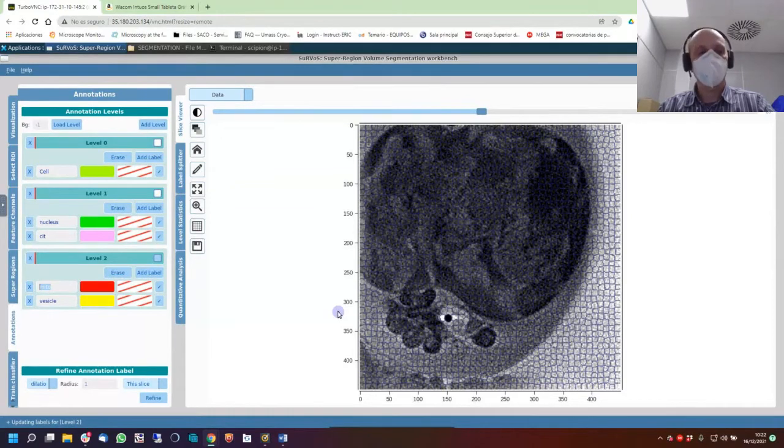It will be extracted that way. So not only the numbers, but also the position and the name. It would be nice to keep the same if it's needed. Sometimes not. It's a matter of the purpose that you have. If you want this type of comparison, you need it.